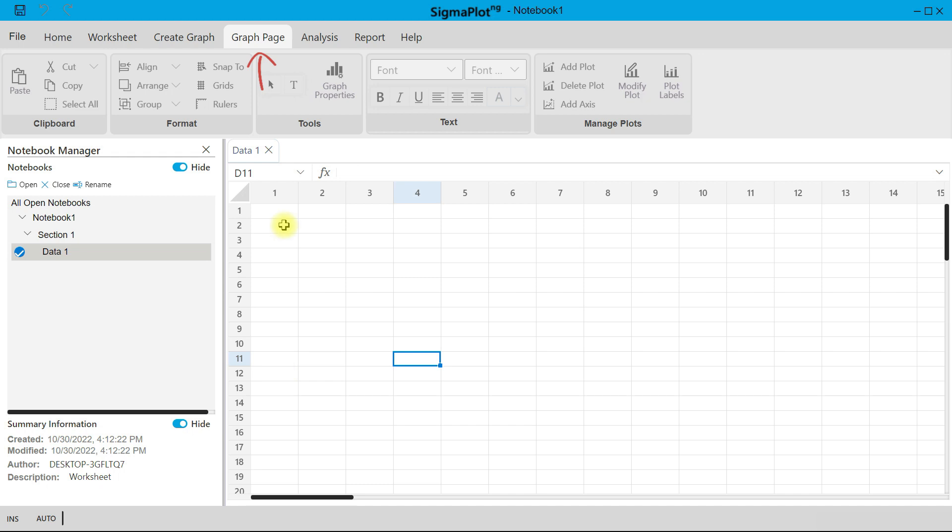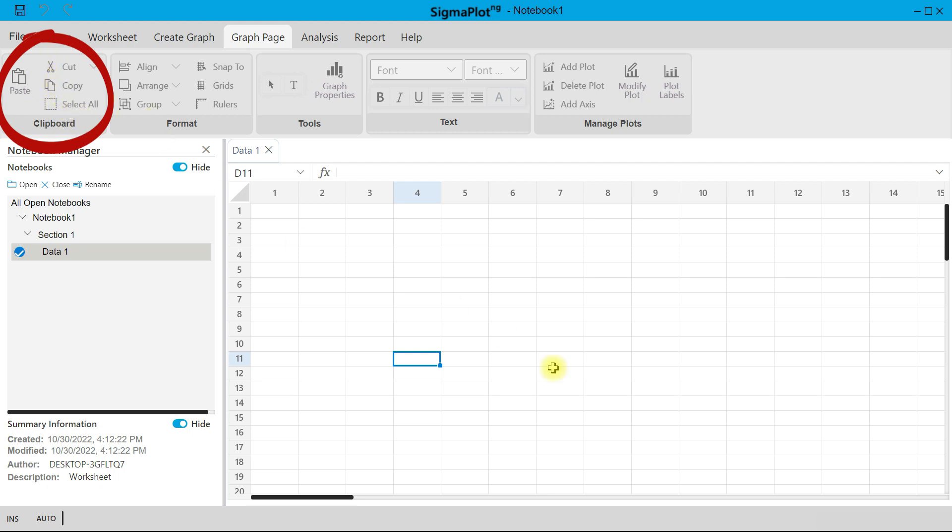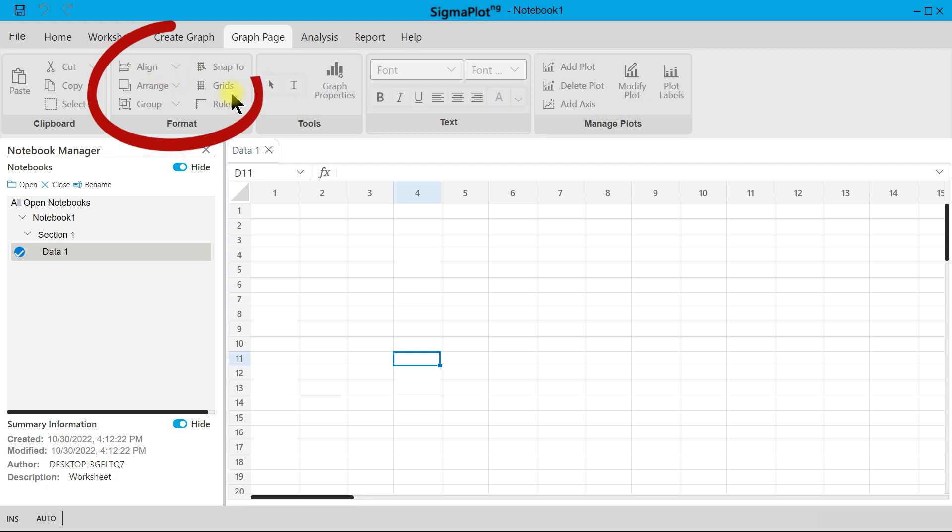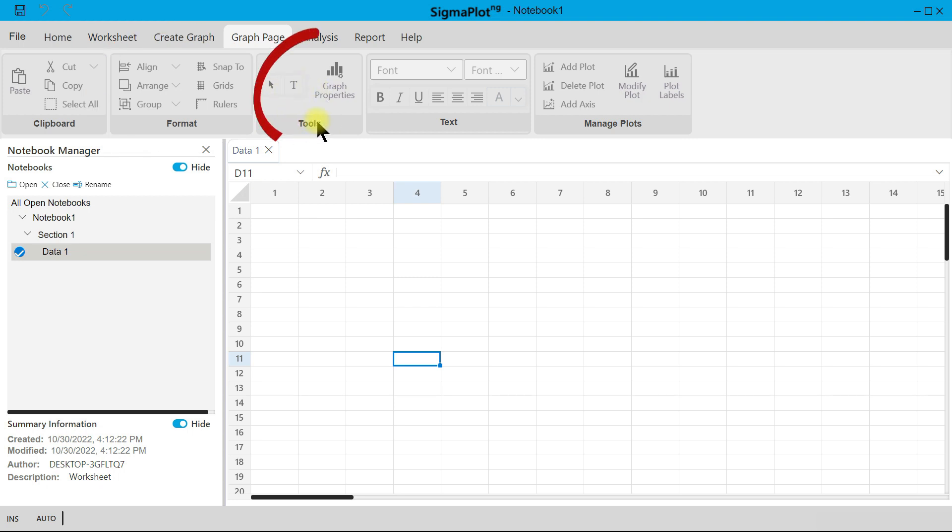You have the regular copy and paste - you can copy something and paste it there. You can format it, align, arrange, group certain structures together, and move them around. Tools can be chosen from this part, and under Tools you can go to Graph Properties and adjust your plotted graph.